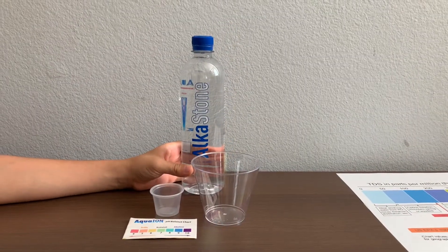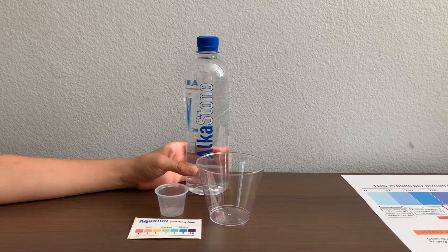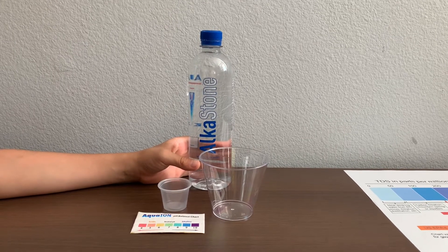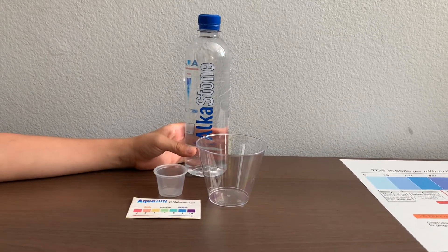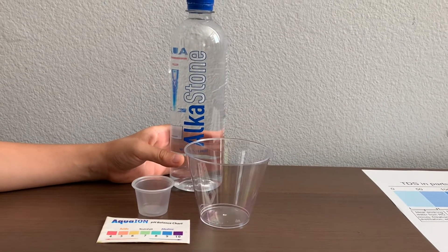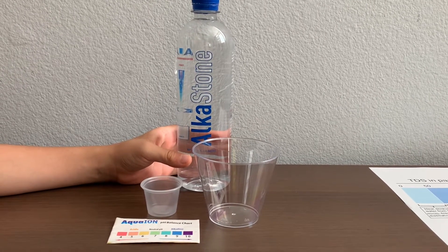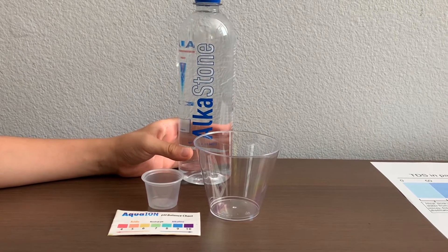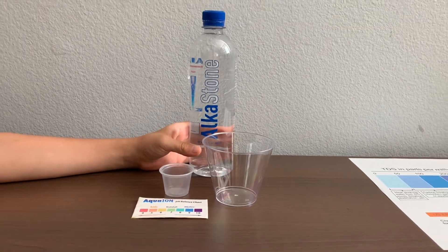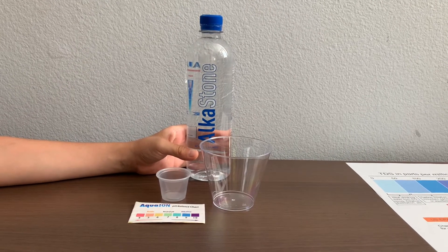This is AlkaStone spring water sourced from California, USA. The pH balance in this water is supposed to be 9.5 to 10. AlkaStone water stimulates natural melted mineral water using advanced methods of purification and mineralization by alkalinizing through natural mineral stones without any added chemicals. AlkaStone water is sold at the Pavilions Market in California.